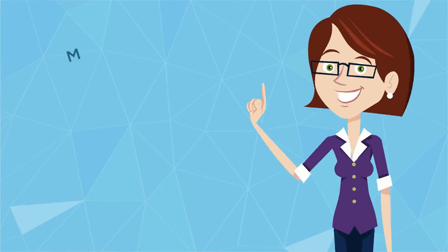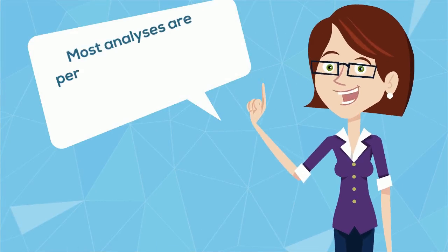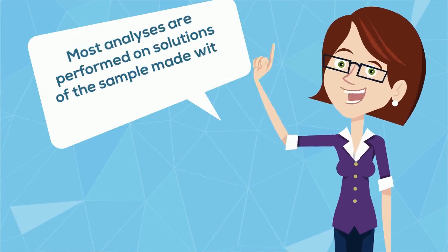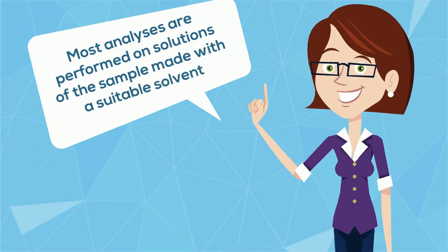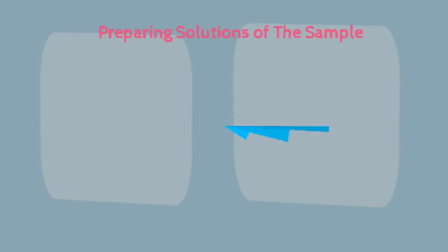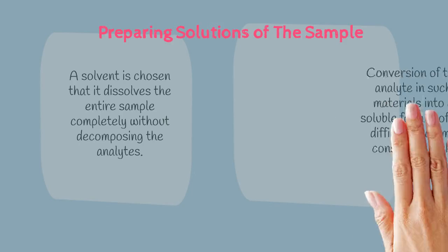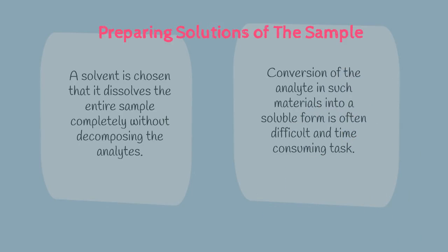Most analyses are performed on solutions of the sample made with a suitable solvent. Therefore, for solid sample, it must be converted into a solution form. In order to prepare solutions of a sample, a solvent must be chosen that will dissolve the entire sample completely without decomposing the analytes. So this conversion is actually a difficult and time-consuming task.